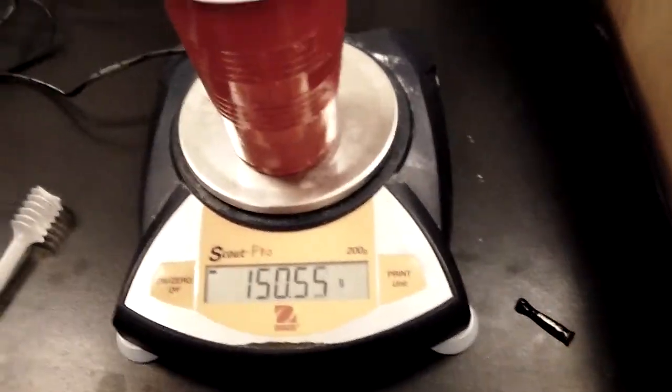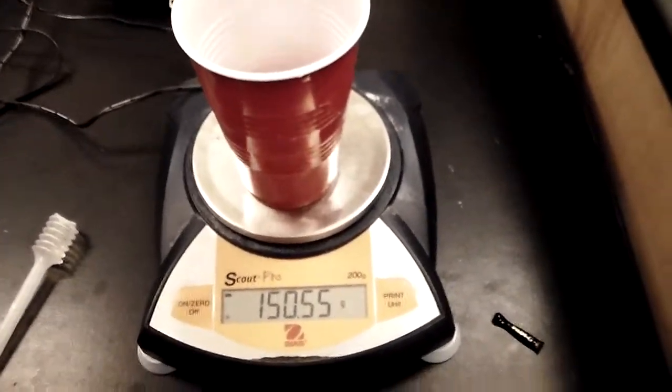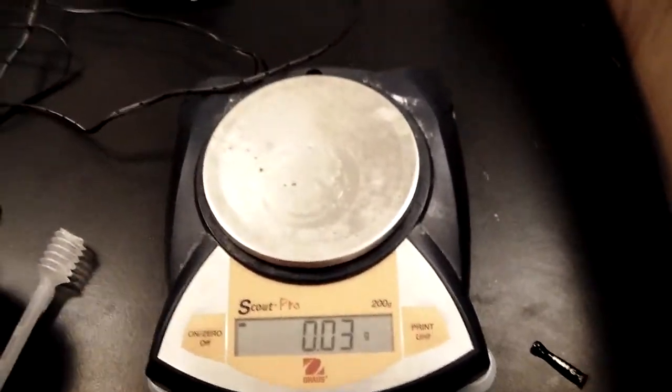I put in a cup of water and it reads 150.55 grams. It's that easy.